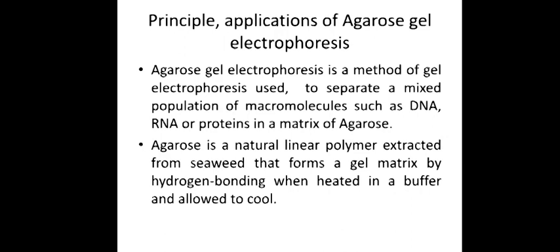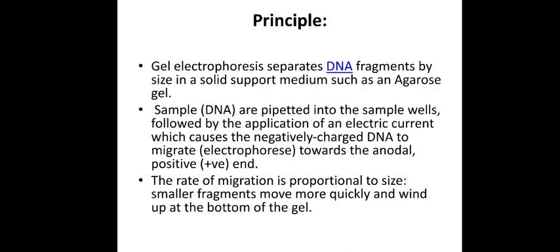The hindrance or the resistance by the medium is very minimal. That's why agarose gel electrophoresis is used. Here it is used to separate DNA fragments more commonly. Here the separation is based on the size of the molecule, the DNA fragment. Larger DNA fragments will move slower, whereas smaller fragments will move faster.